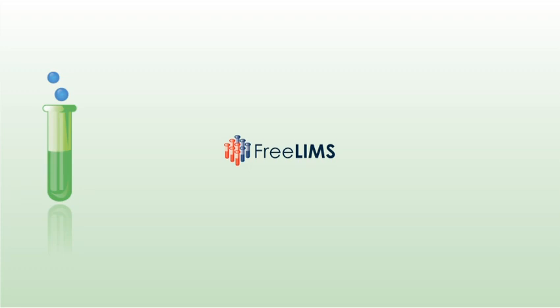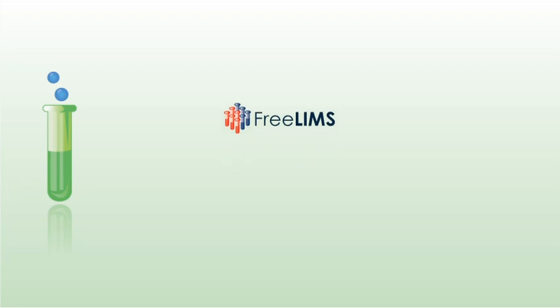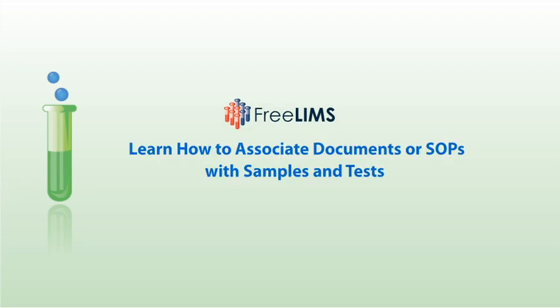Hi, welcome to this video. This video will walk you through the process of associating documents or SOPs with samples and tests.